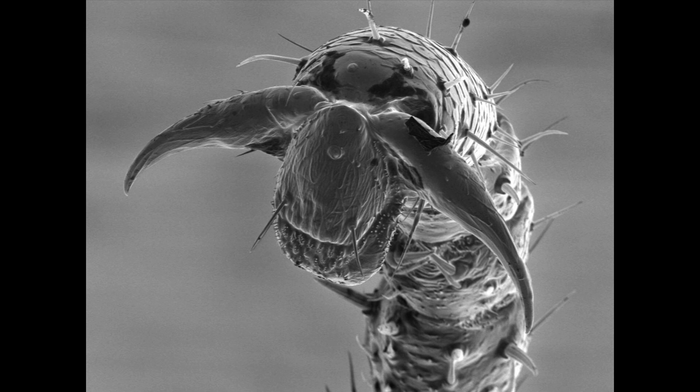German cockroach leg structure. By using the nanosuit method, it is possible to quickly observe the ultra-fine structure that reflects the living state.